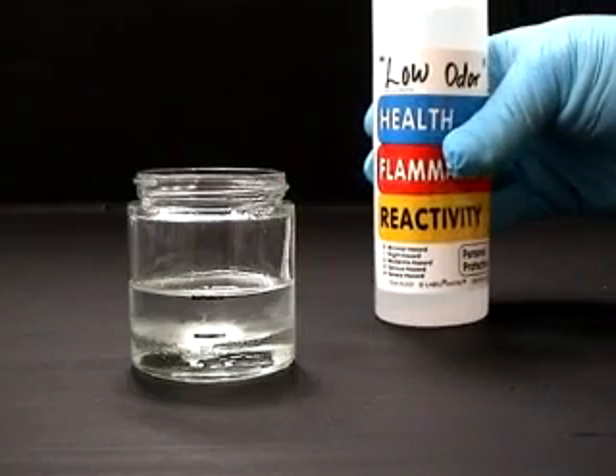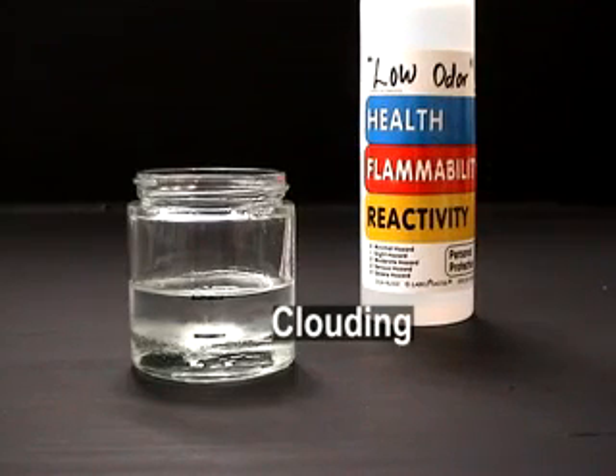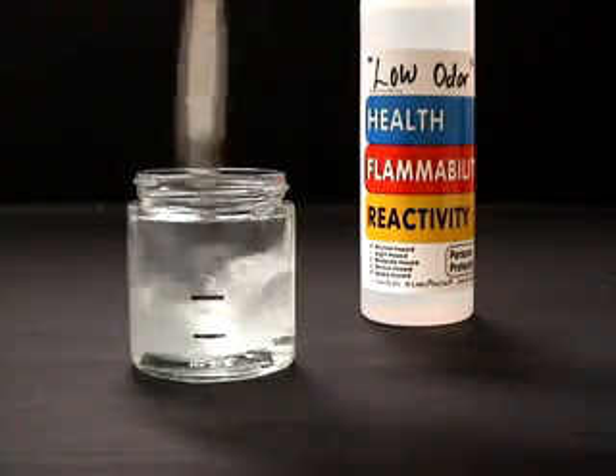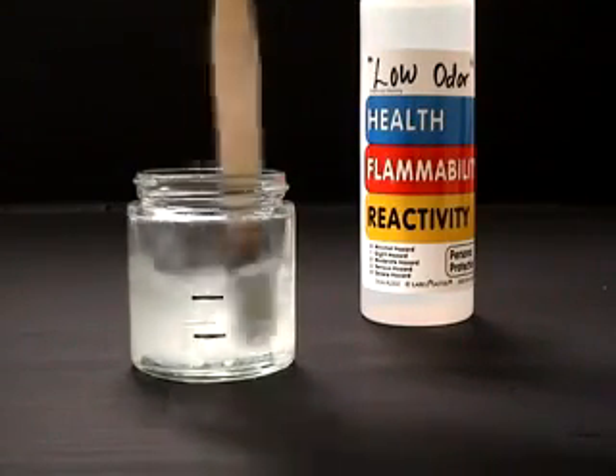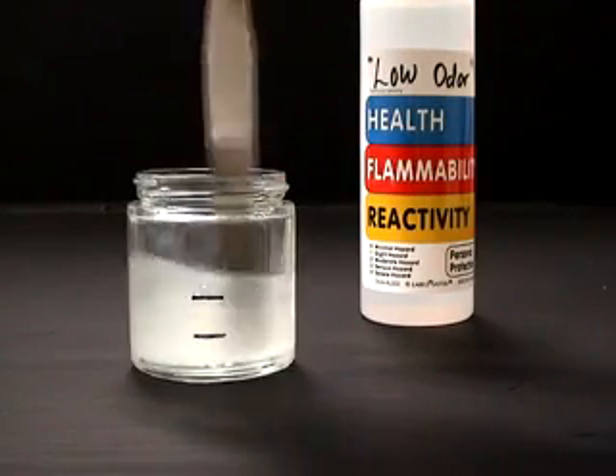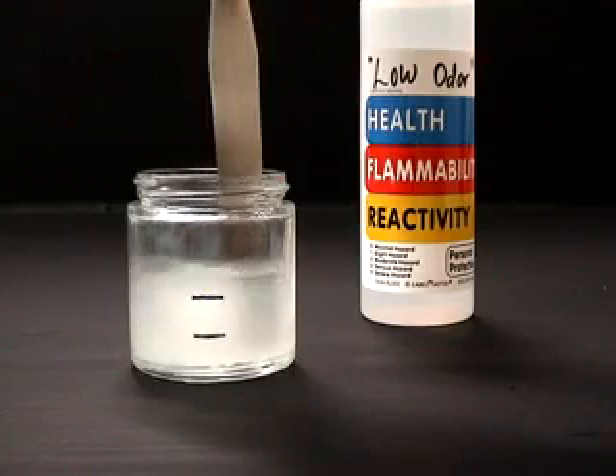The first indication of incompatibility is the clouding where the solvent and the varnish meet. Begin stirring. Notice how cloudy the varnish mixture becomes. Regardless of how long this mixture is stirred, it will not clarify, indicating this solvent should not be used with MSA varnish.